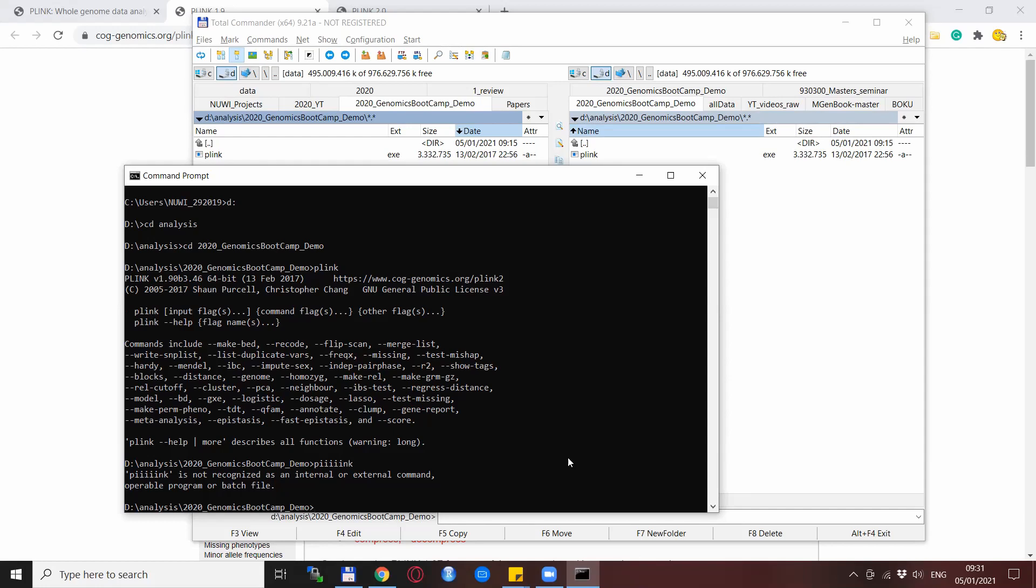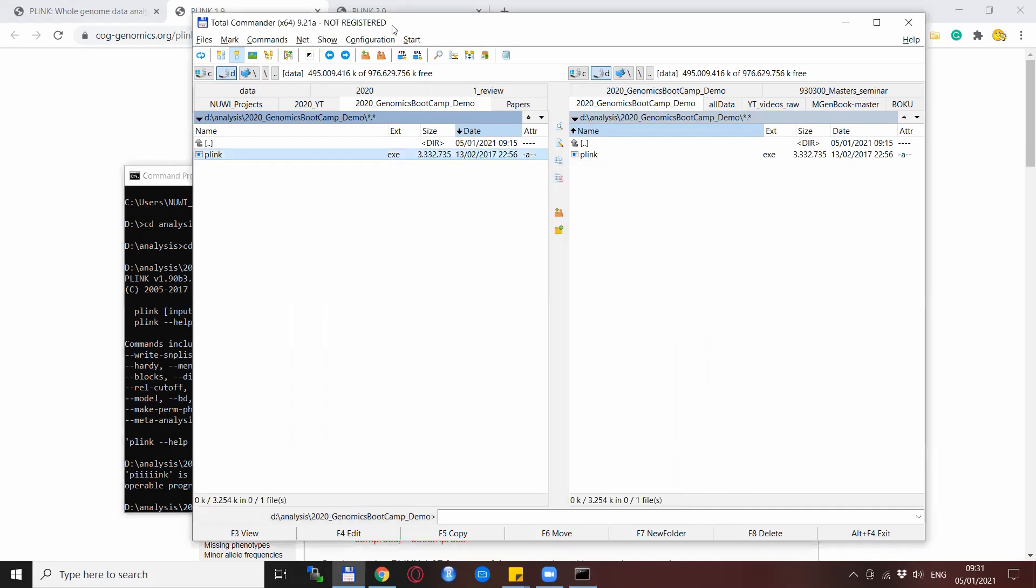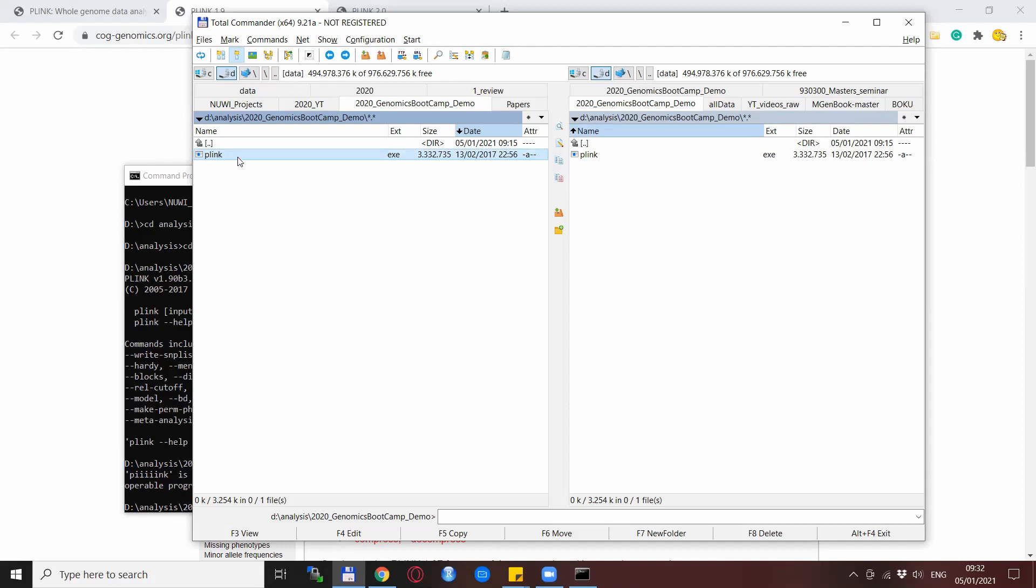The other very frequent error is when you try to start plink from a folder where it is not there. So the executable file is not located there, or when you accidentally delete the plink executable file. Right now we have it easy because this is just the only file in the directory. But later on you will see that there will be many files and if you move some of them or delete some of them then it might happen that the plink executable file is also deleted. So let's see what happens then.